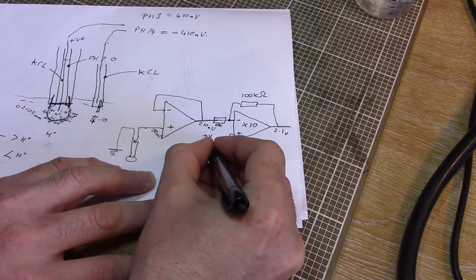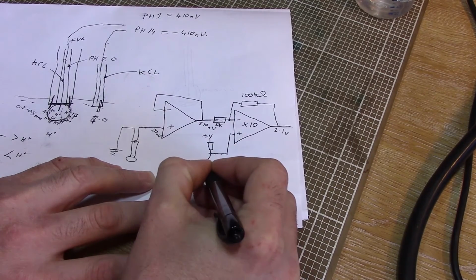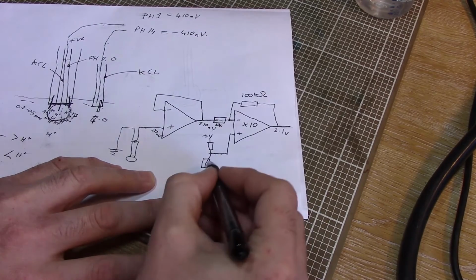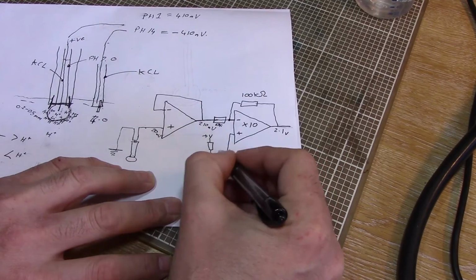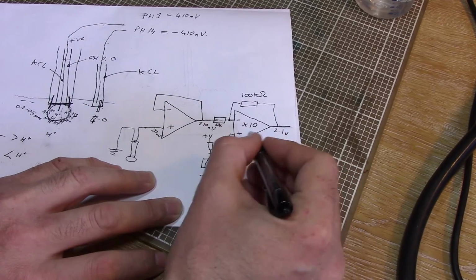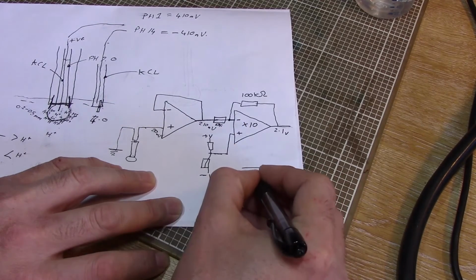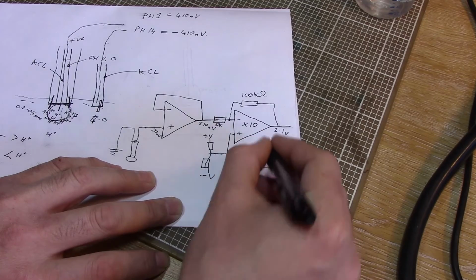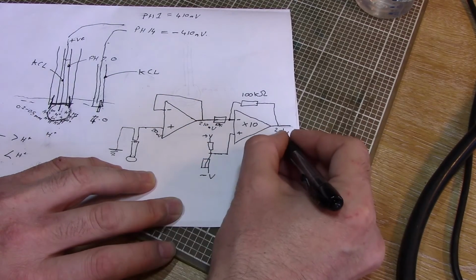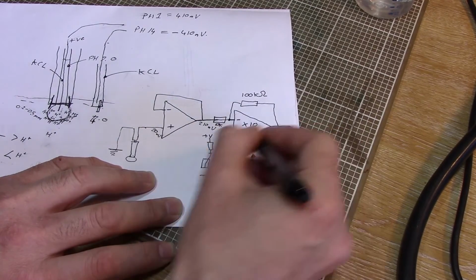and this resistor network sits between positive and negative. Oh, let's draw another one in. I've drawn a fuse now. This resistor network sits between positive and negative, and by changing how much positive or negative this pin is, we're shifting this relative to 0. So if we shift this pin up, our voltage shifts up. If we shift that pin down, if we pull this pin down to say -2 volts, we're basically taking 2 volts off that value, and it's an exact add or subtract.